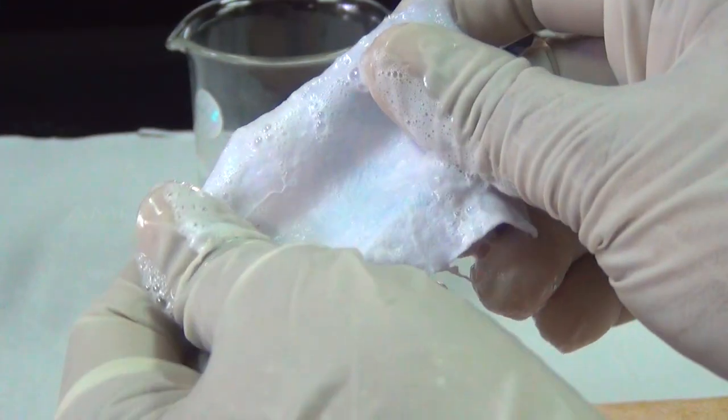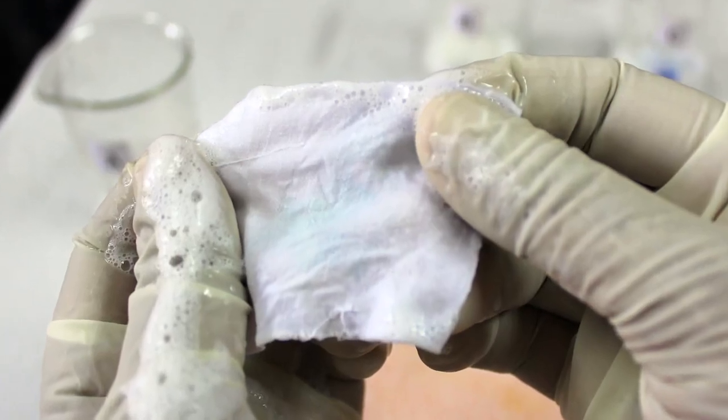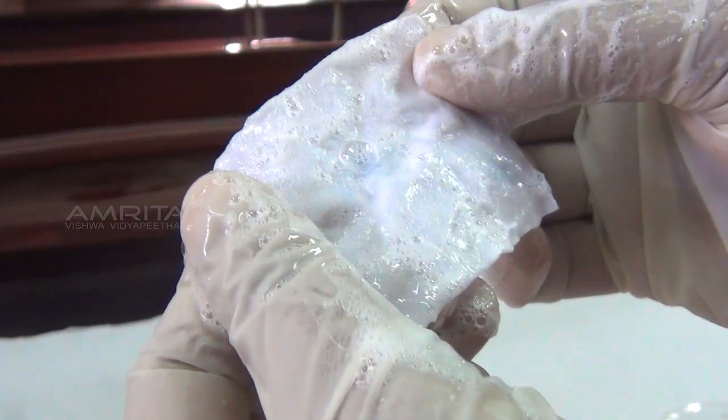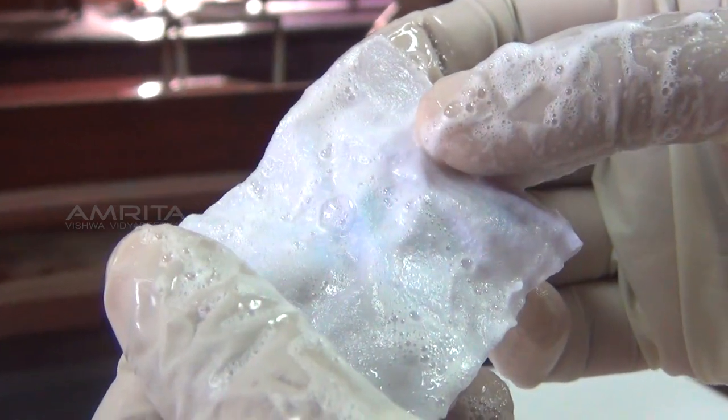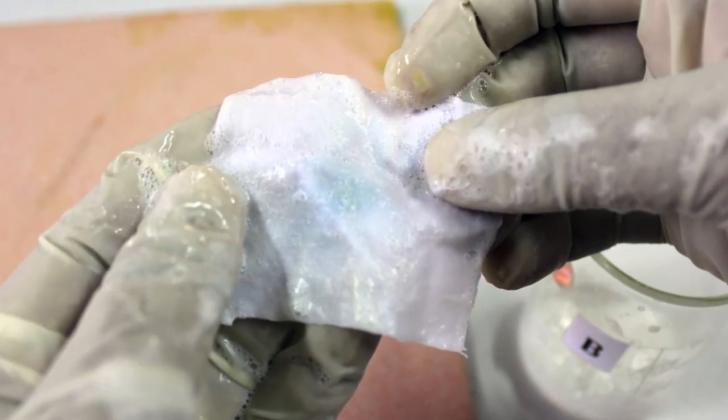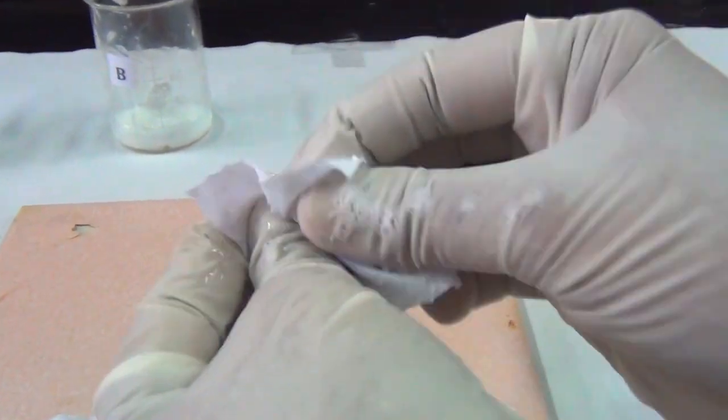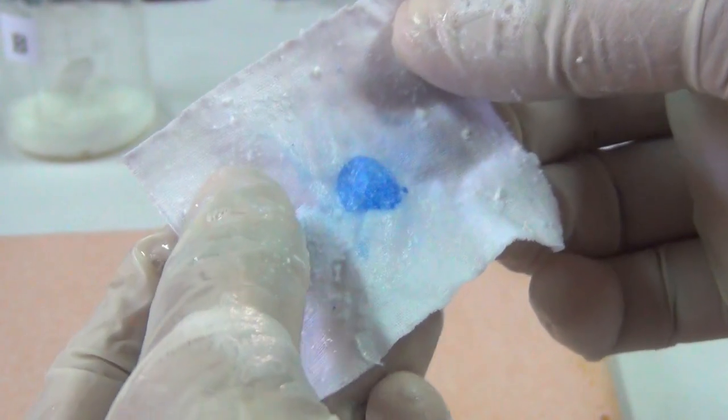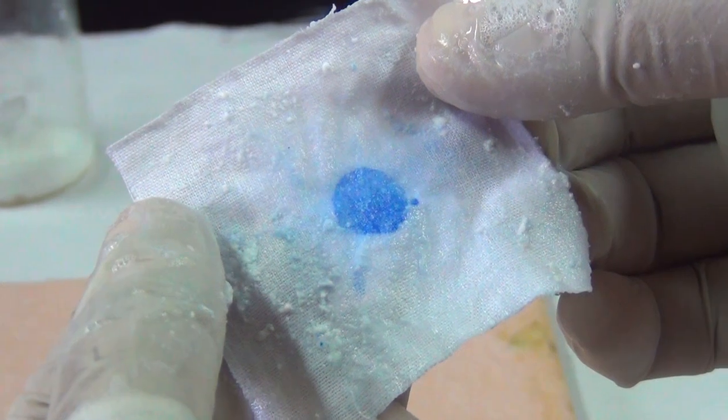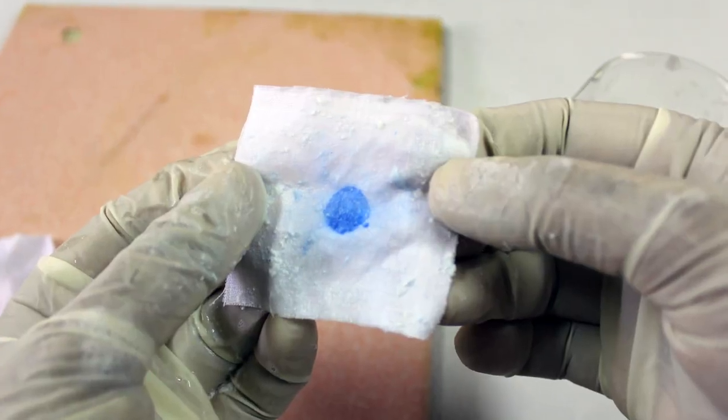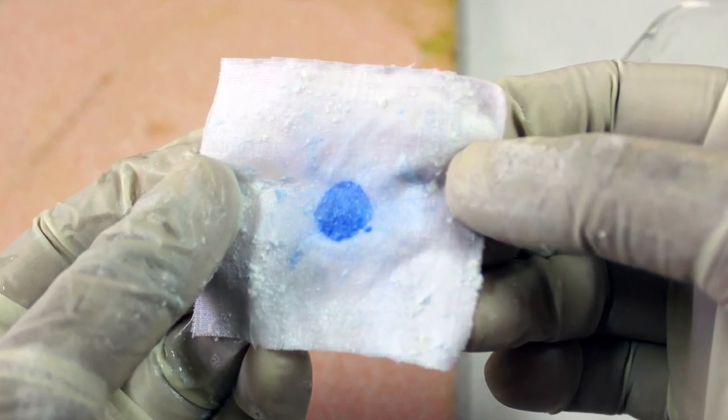The ink spot on the cloth dipped in soap solution A has almost disappeared. The ink spot on the cloth dipped in soap solution B has partially disappeared. There is no change in the colour of the ink spot on the piece of cloth dipped in soap solution C, rather some scum has been deposited on the surface of the cloth piece.